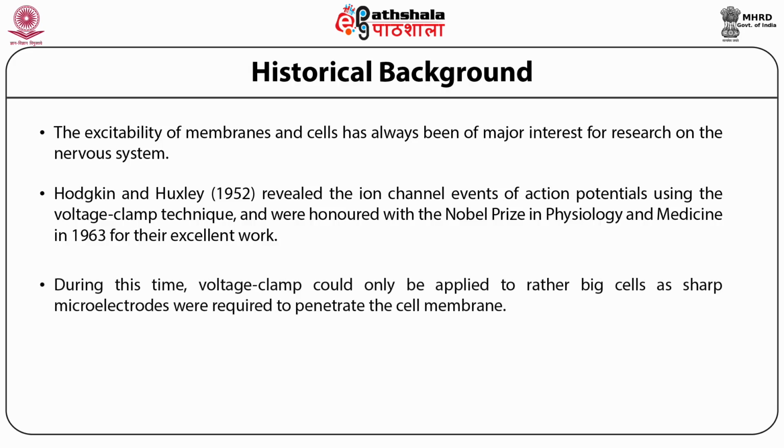During this time, voltage clamp could only be applied to rather big cells, as sharp microelectrodes were required to penetrate the cell membrane.